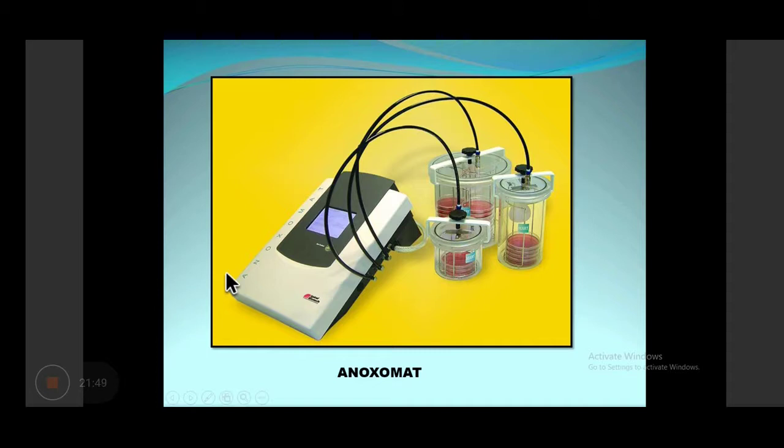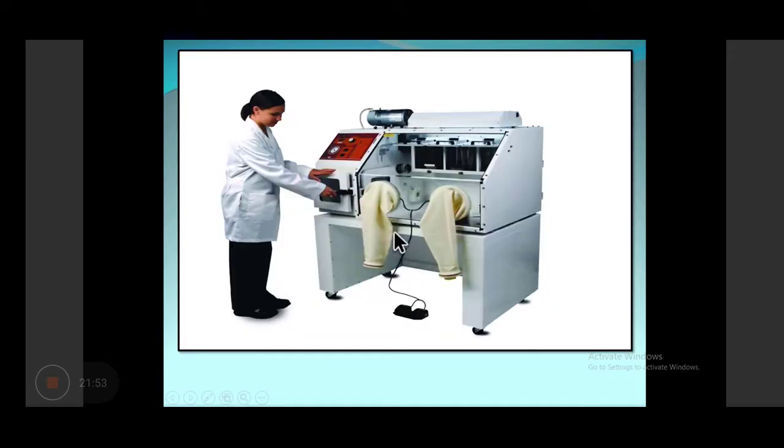So we will do this cap. This lid should be closed during the functioning or during the activities of this anaerobic jar.